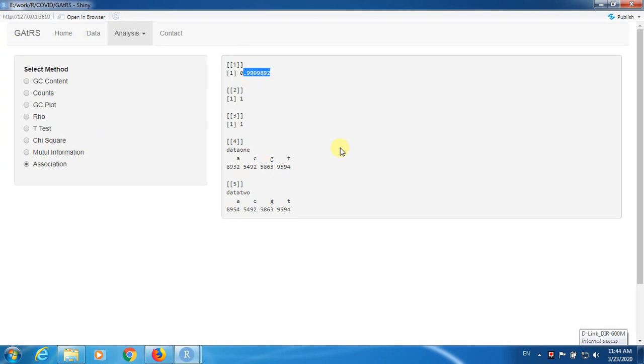These gene sequences are highly unreliable. No two gene sequences done by two different individuals are similar in fact, and they tend to have different configurations. It depends on which source you downloaded these data files from. Your metrics are only as good as your data, that's it, nothing else.